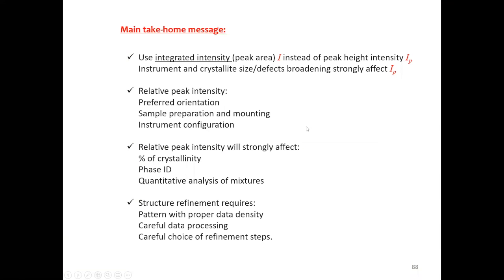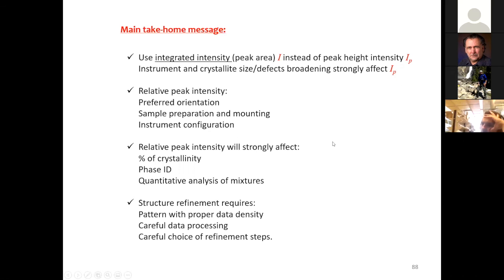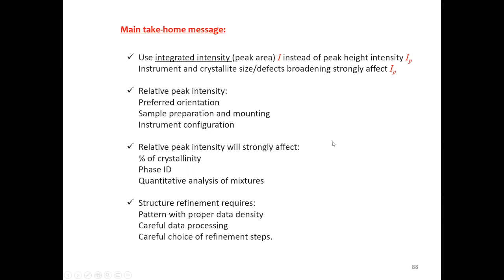Well, I can see that my peaks are different from the reference. Some of them are even missing. Let's see this guy run a copper film, and basically he's just seeing 2 peaks. Where are the other ones? What is going on? Who stole my other peaks? Why are you not seeing some of these peaks that should be present?